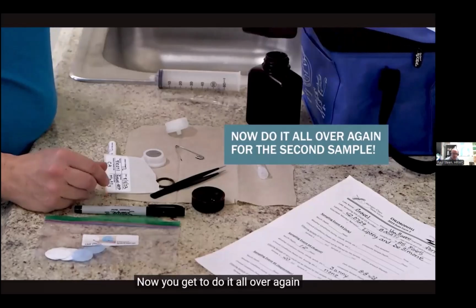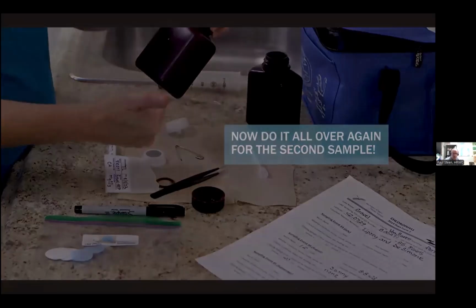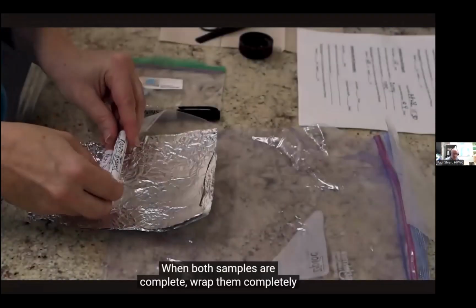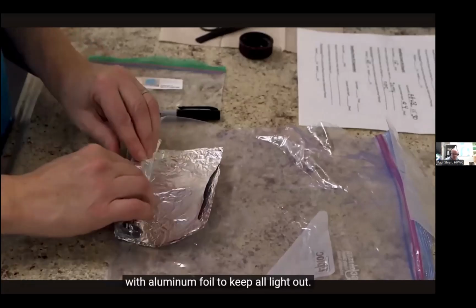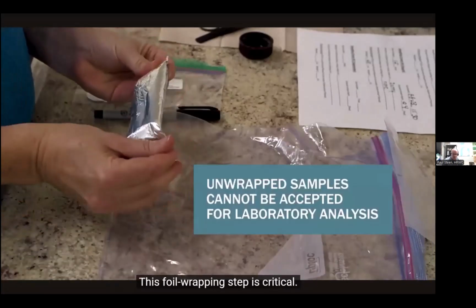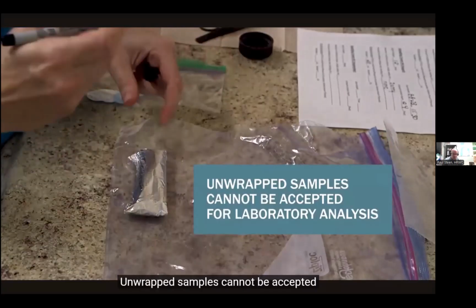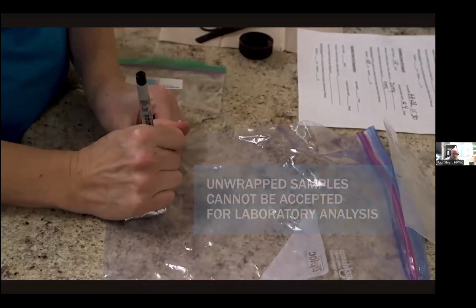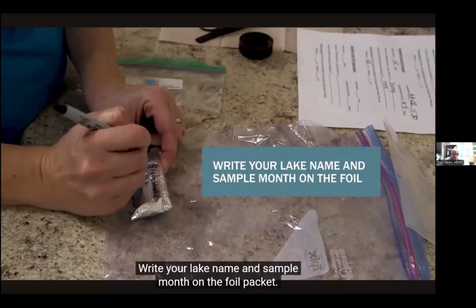Congratulations! Now you get to do it all over again with the second sample bottle. When both samples are complete, wrap them completely with aluminum foil to keep all light out. This foil wrapping step is critical. Unwrapped samples cannot be accepted for laboratory analysis. Write your lake name and sample month on the foil packet.